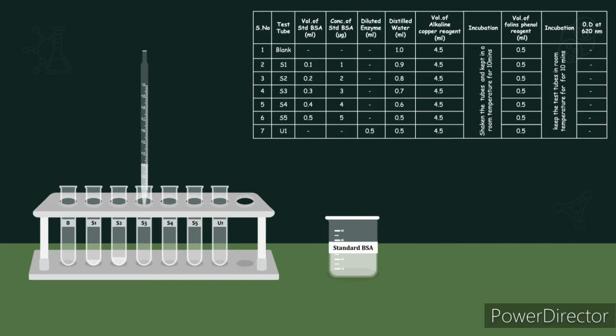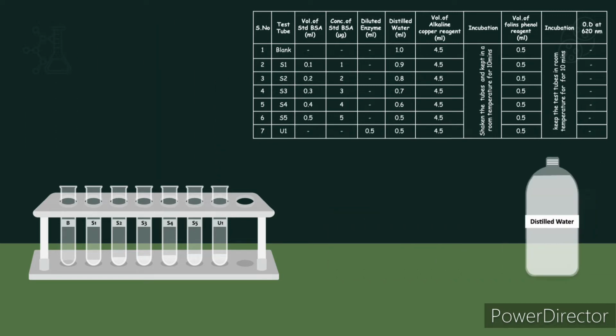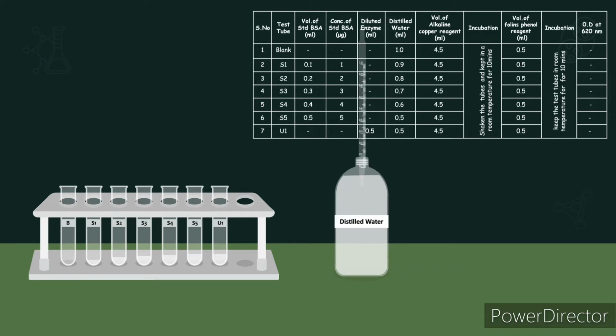So for protein, Lowry's method, 620 nanometer. The blue color developed is measured spectrophotometrically. This is an age-old method, used widely even in this day and age. This is the most followed method of protein estimation. It was pioneering work by Lowry a long time ago.